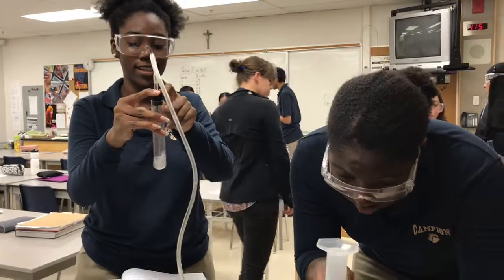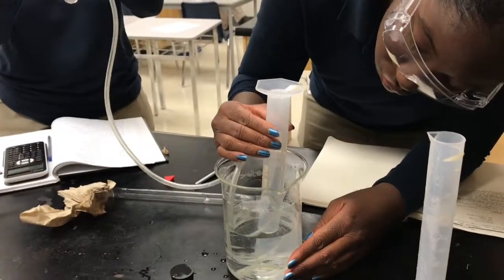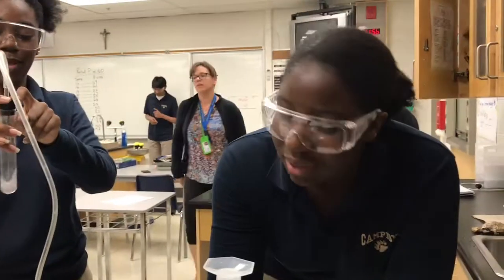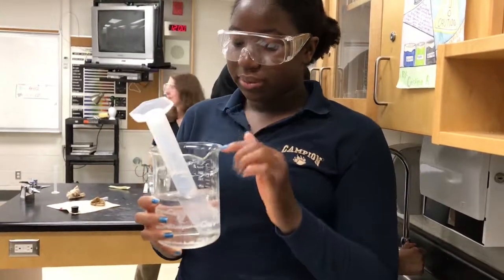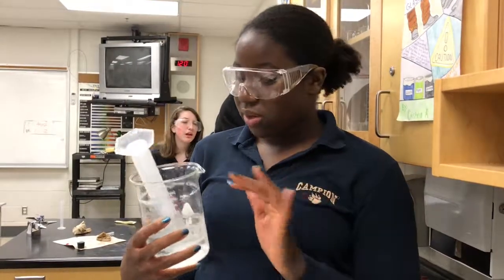You better not go too far above 50. Do you guys want to see her just stop shaking at that point and just leave it? So the last time we made too little, now we're making too much. Oh, it's over 50? I'm holding hydrogen gas. How much did we collect? 62 milliliters, which is more than we're supposed to, but whatever.